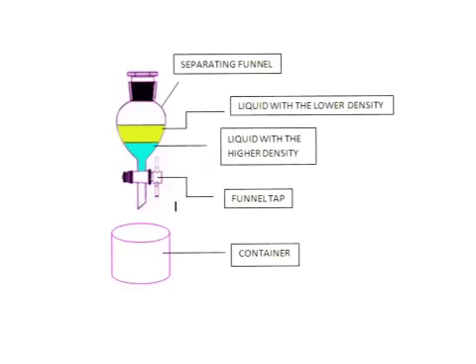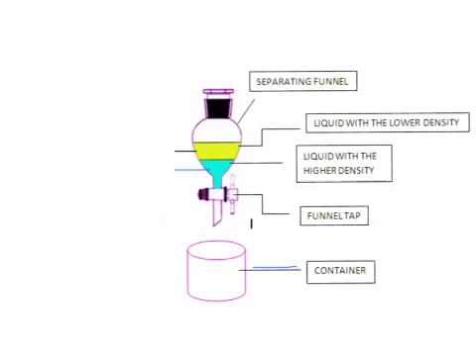The compound of interest is dissolved in a solution, and a second solution is added to the mixture containing the compound of interest. The compound of interest is more soluble in the second solution than in the original mixture, so some of it will leave the original mixture and dissolve into the second. The immiscible liquids are usually water and an organic solvent.